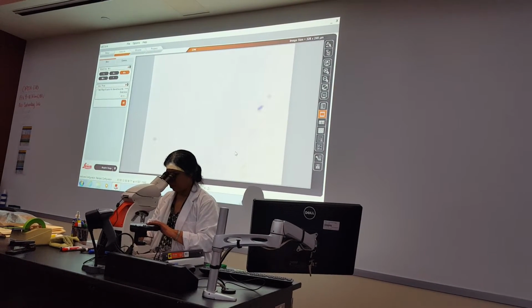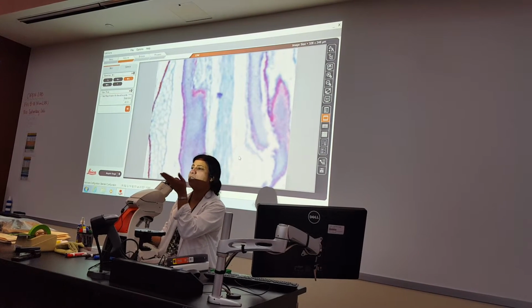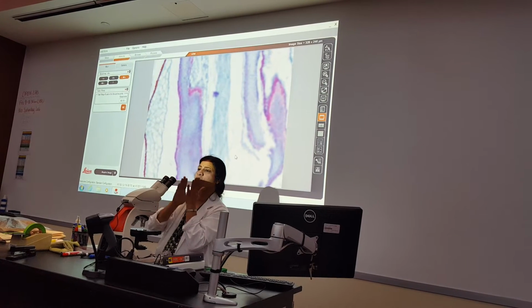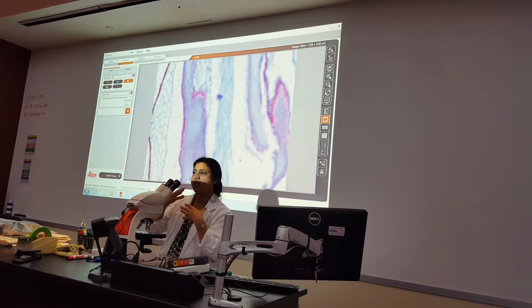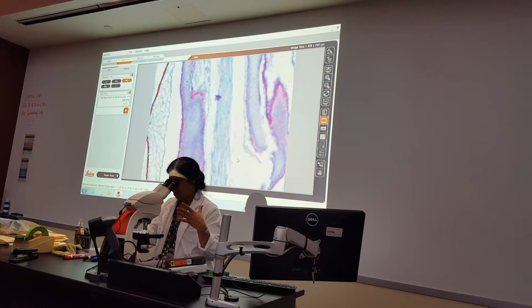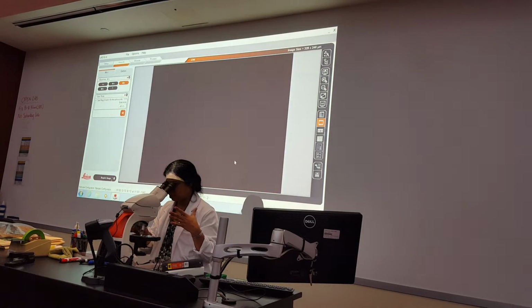Now the capsule, what you see here is only part of it. Guys, the capsule you're able to see with your naked eye. So it's a huge structure. Imagine if I have to squish it on a slide. You will see a big structure. So you're not really seeing the entire capsule. But if you see this, you know it's a capsule of moss, and these are the spores.